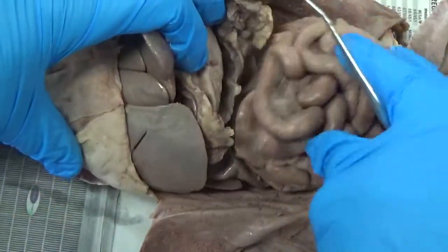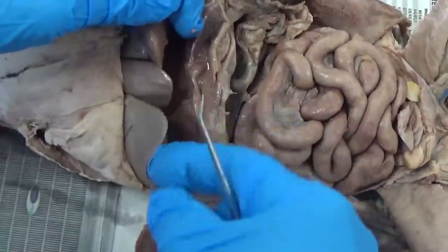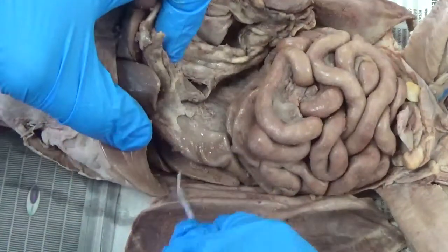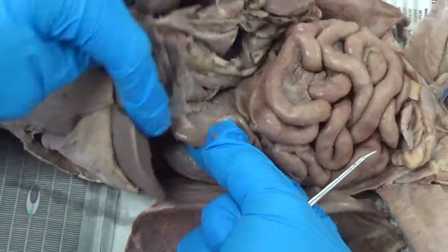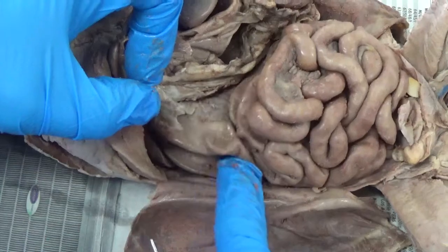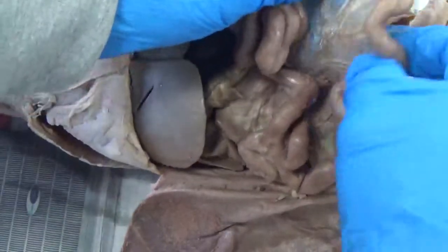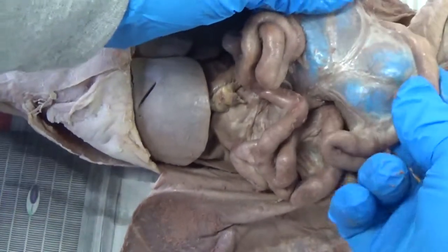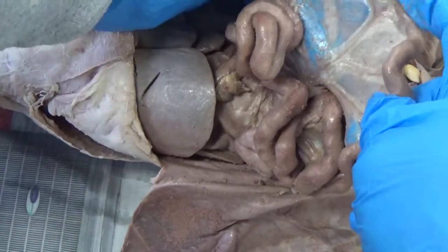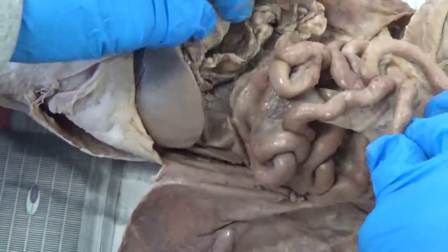The small intestine takes up a great portion of the abdominal cavity. Here's the stomach again, and right here you can see the beginning of the small intestine. It's coming off of the stomach. The first part of the small intestine is called the duodenum. The small intestine is kind of held together by a lot of this membrane structure. This is called the mesentery. It's kind of translucent. It has blood vessels, and of course all these blood vessels are taking nutrients away from the small intestine, where most of the digestion and absorption of food takes place.